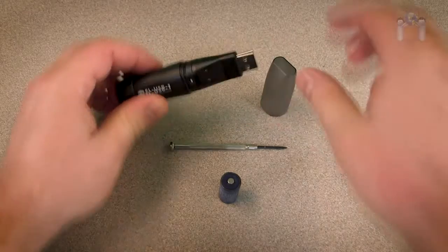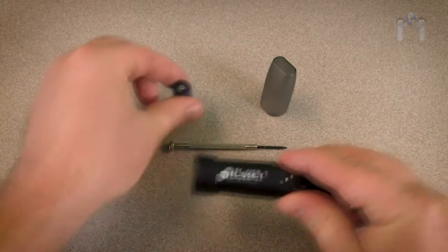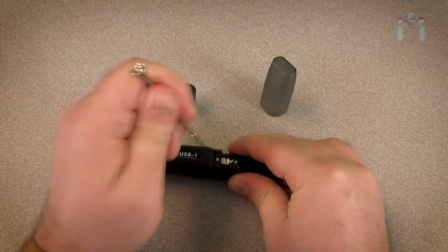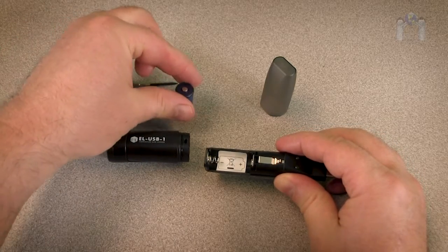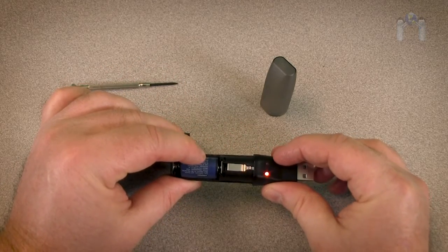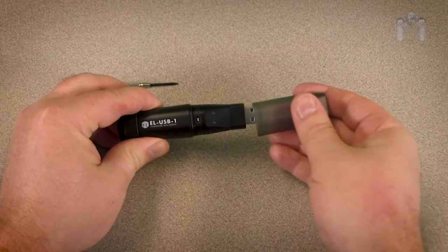Remove the cap and locate the small silver clip on the side of the data logger. Take the jeweler's screwdriver and press down on the clip until you feel the cover give way. This may require a little practice. Remove the cover and replace or insert the battery, paying attention to the polarity. You should notice the LED lights flash when the new battery is properly installed. Slide the cover back and you are ready to set up the data logger.